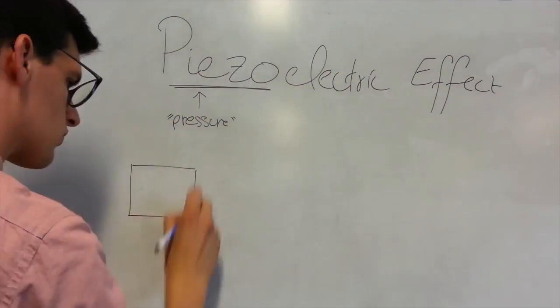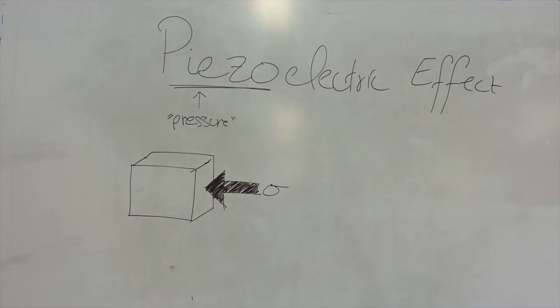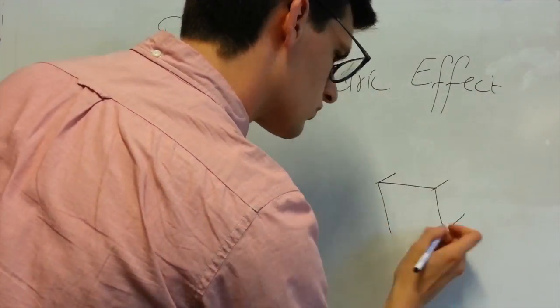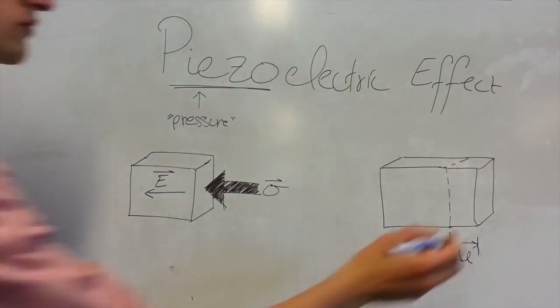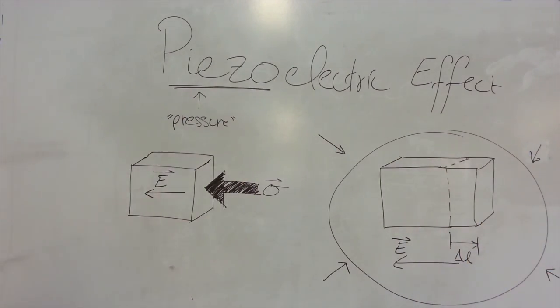I was granted the opportunity by the University of Michigan's Optics in the City of Light, iREU, to work under Professor Laurent Daniel analyzing X-ray diffraction images of piezoelectric ceramics. Deriving its name from "pressure of electricity," the piezoelectric effect involves the deformation of a material to produce a net voltage, or the application of external voltage to induce a deformation. The experiments performed deal with this latter instance.